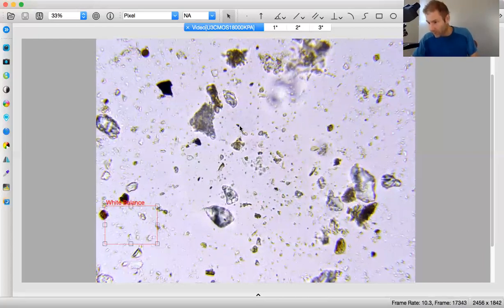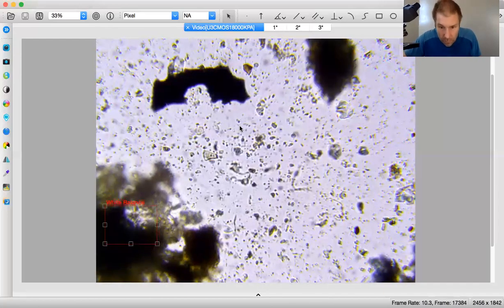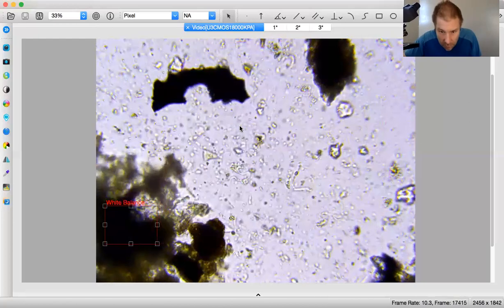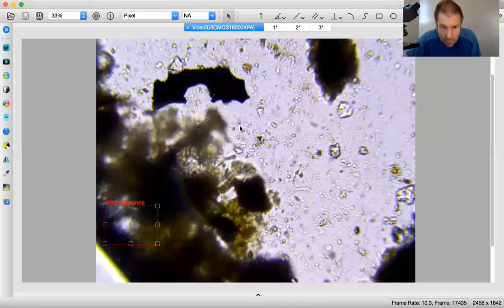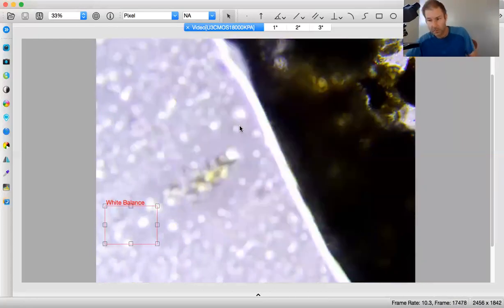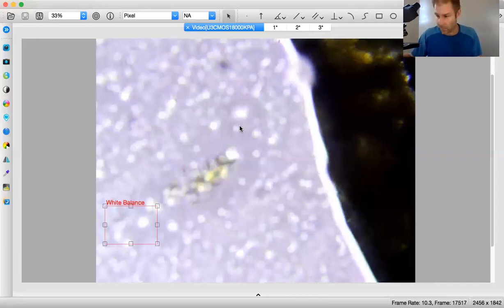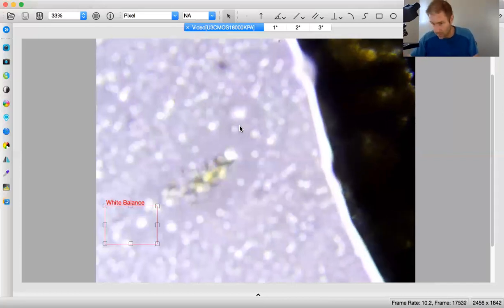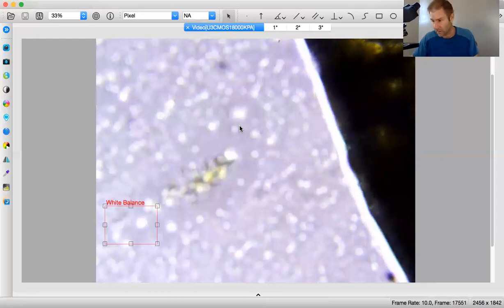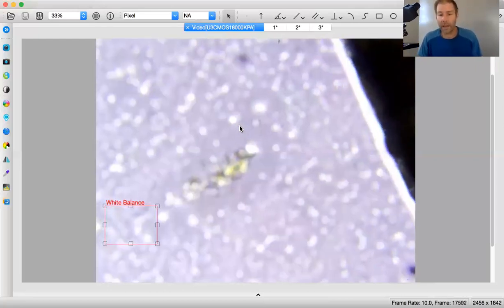And 5. Go. Oh. Uh-oh. What's happening? Our sample's drying up. No! Well, that sucks. No! Okay. Well, this was going to be a good assessment.